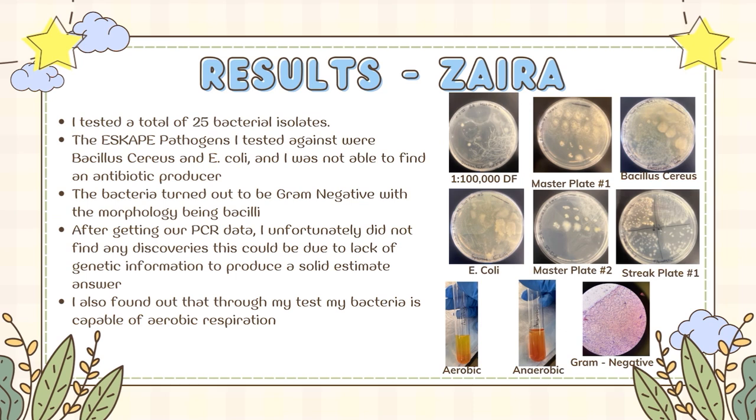I also found out through my testing that my bacteria is capable of aerobic respiration. I know this because of the change in the color of my test tube, and hence the color in my test tube of anaerobic did not change. Hence, there was a change in the aerobic, telling me there is aerobic respiration.